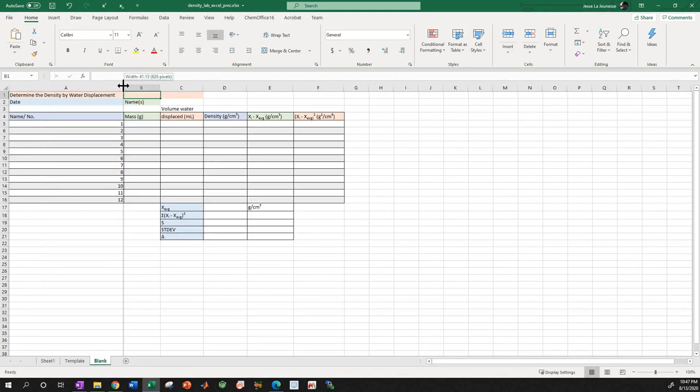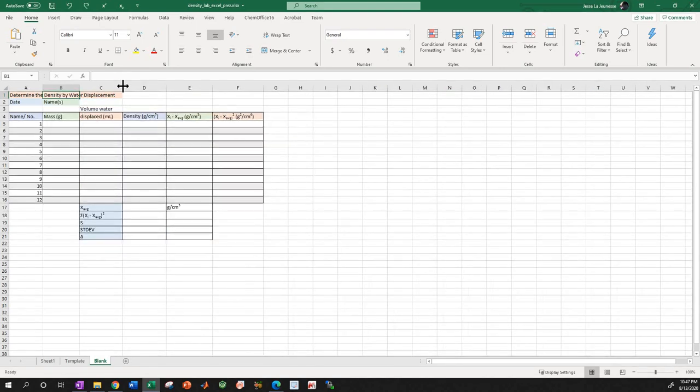Well, actually, here's a good thing. Say I wanted to revert that change. Control Z. Boom. Awesome. Okay. So I went through and I just labeled these, just as they are in your book. You can do the same, or you don't have to. You can do it any way you want.